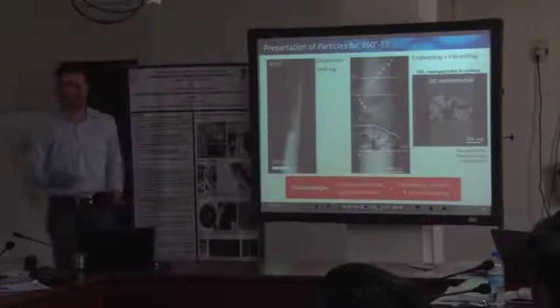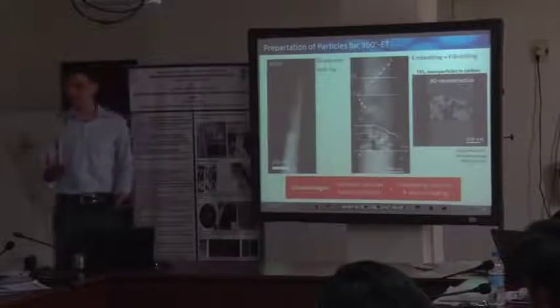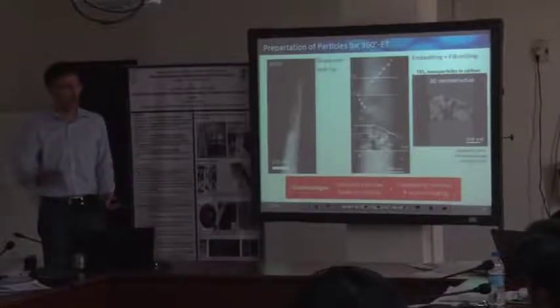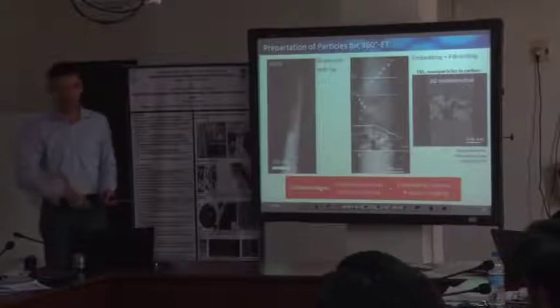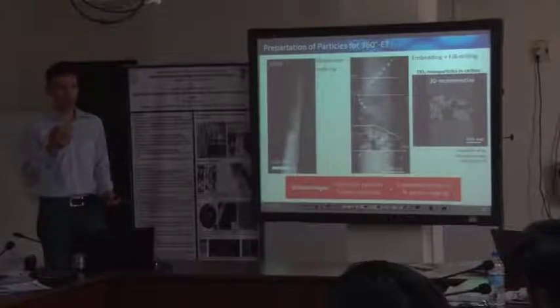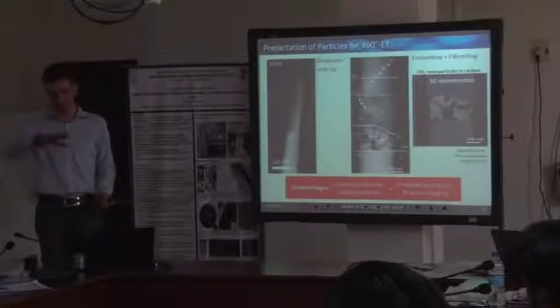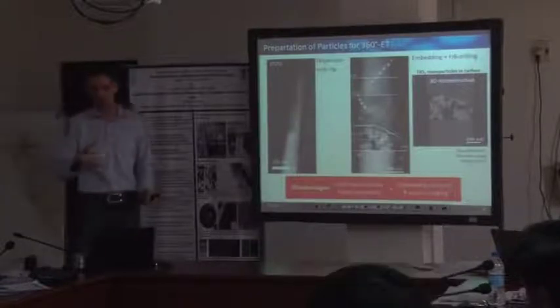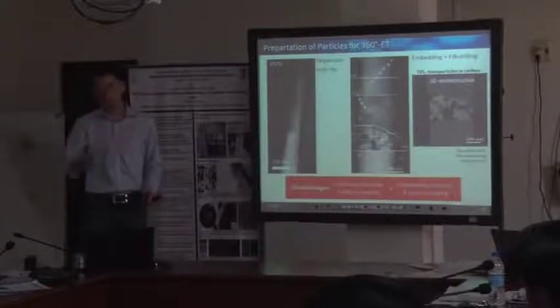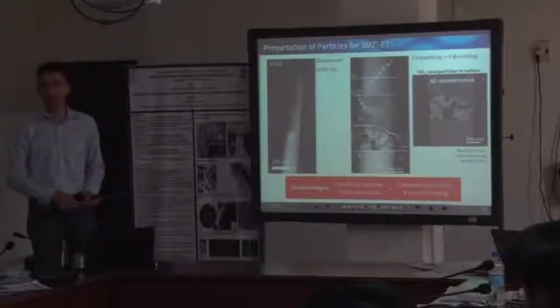But what happens is that the support film might shrink, for example a carbon film that was prepared from a polymer by a pyrolysis step. The film might shrink and move, so it's not the particle itself. That might cause some trouble because even the relative tilt angle might change. This is a movement in the plane. It is not a big deal because it can be easily compensated for, but it is a change of your support.